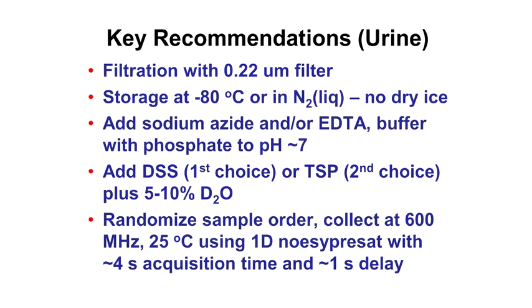But since then, a lot has been done, and over the last 5 years, much is known. In fact, we know almost all of the compounds that you can measure by NMR that could be detectable by NMR in blood, in serum, in urine, in saliva, in cerebral spinal fluid, in cell extracts, and in many juices and wines, and the list goes on. And so when you have a list of what you should expect and what's known, then you can start doing something else, and this is called deconvolution. And that means identifying all of the peaks and quantifying everything.